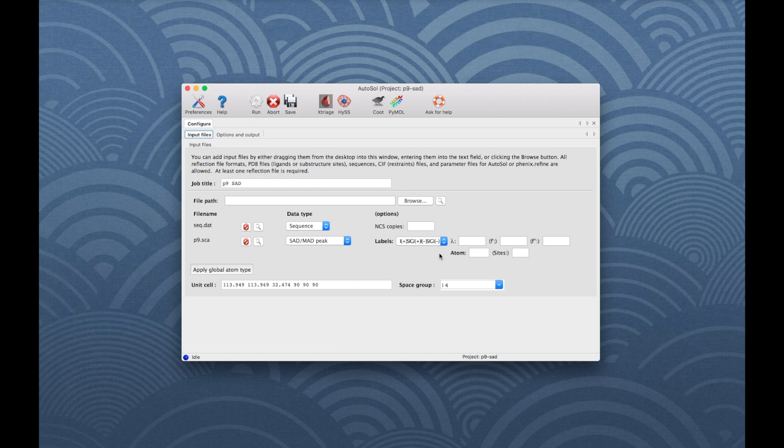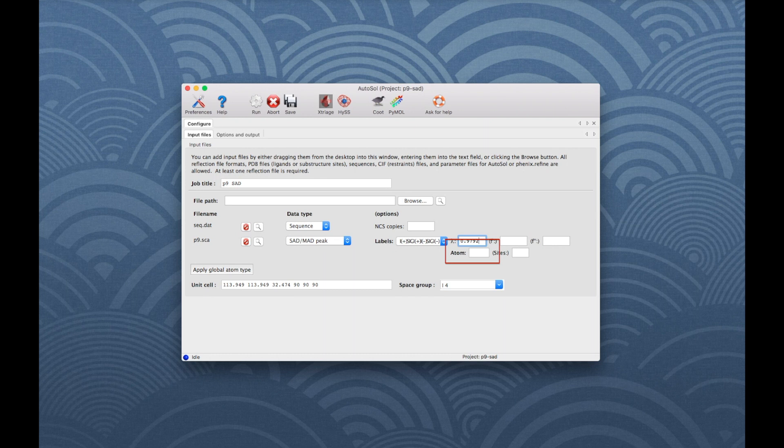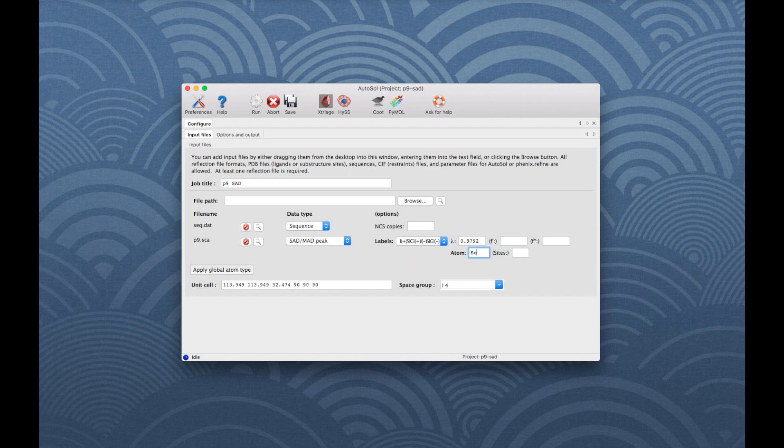To enter the wavelength, go to the box next to the Greek lambda symbol. For this experiment, the wavelength was 0.9792. To input the atom type, enter SE for selenium into the atom box. If we had measured the F' and F'' scattering factors, they would be entered as well. But they are not mandatory as they can be calculated from the atom type and the wavelength.